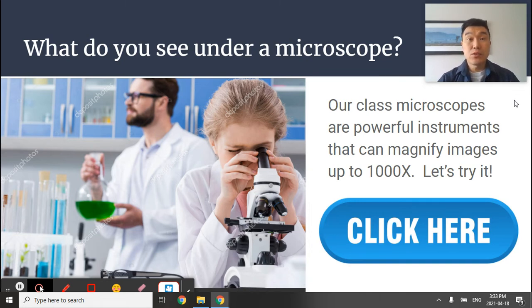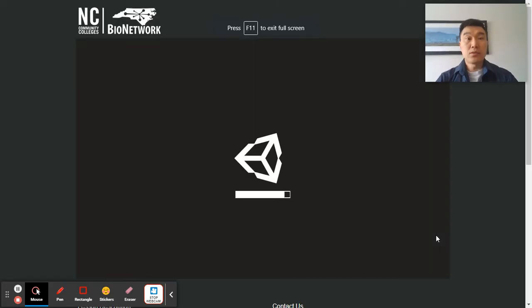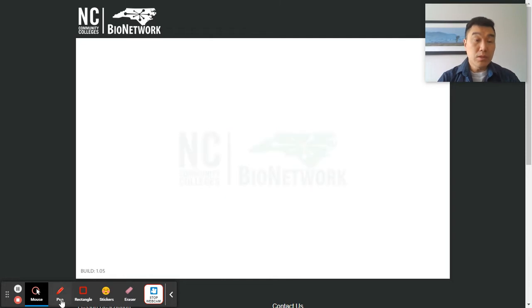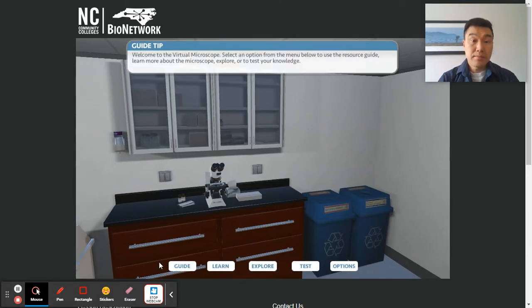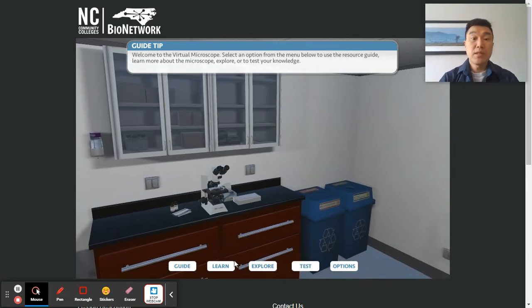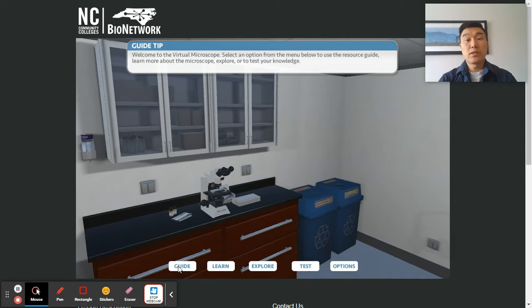In this video, I'll show you how to use the virtual microscope. When you get to this page on my note, you will click here, and that will take you to the BioNetwork virtual microscope. Now, in this virtual microscope, you can do a number of things. You can click on any of the 5 buttons on the bottom, but we're going to stick with the first 3.